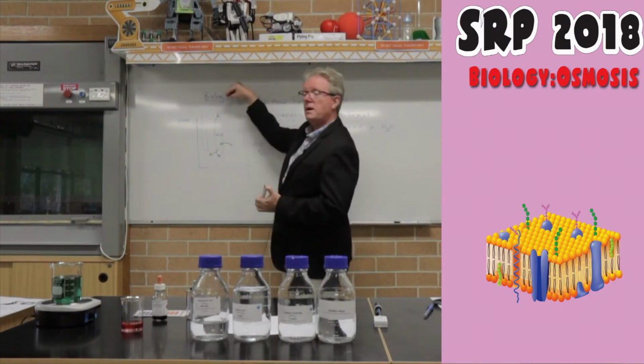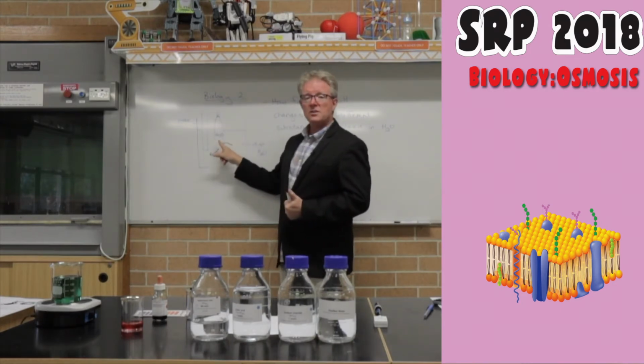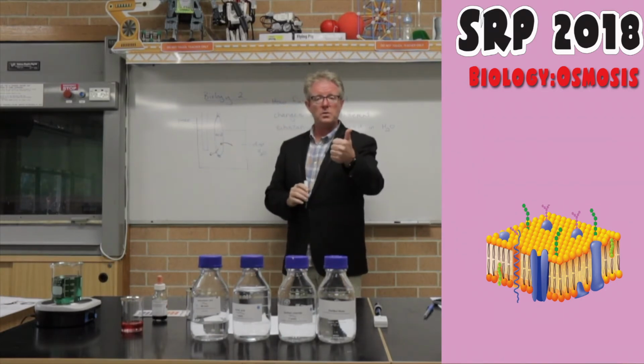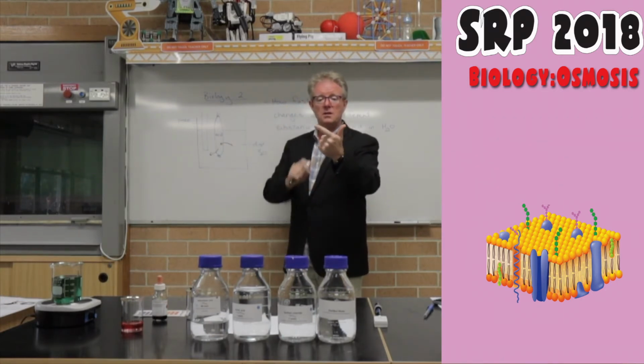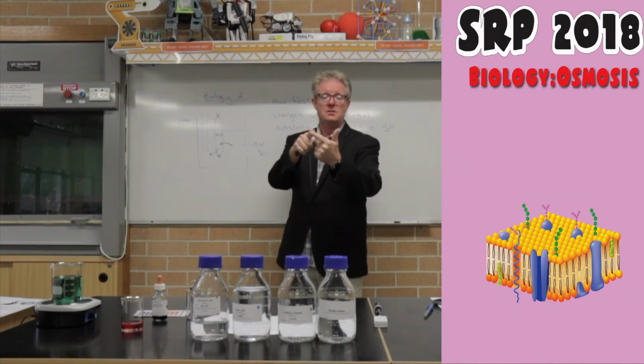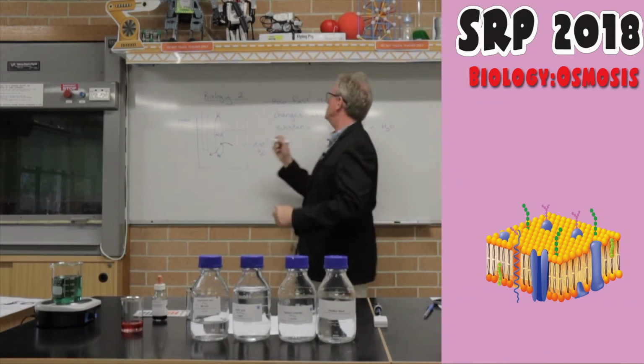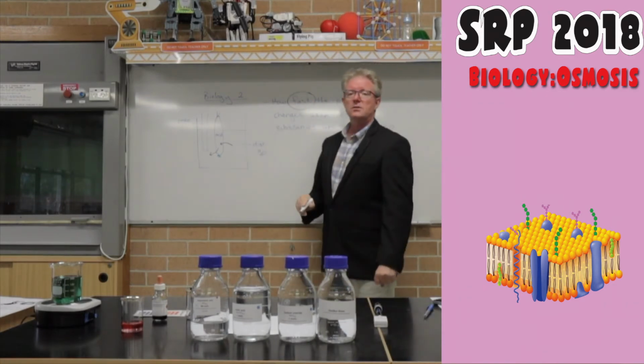So you take the tube out, you measure the pH inside the dialysis tubing, and so now you have 2 pH values for that, one to begin with and then one after 2 minutes. And you should see that there's a difference. And you've recorded it for 2 minutes, so therefore you can work out the rate of change. In other words, how fast, right?